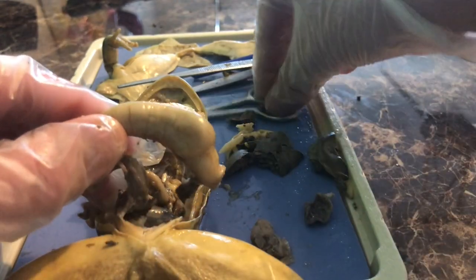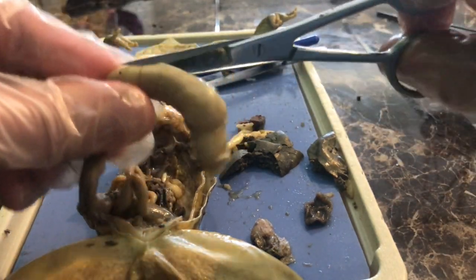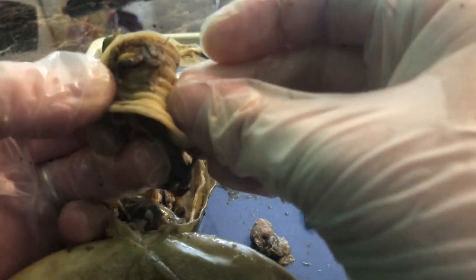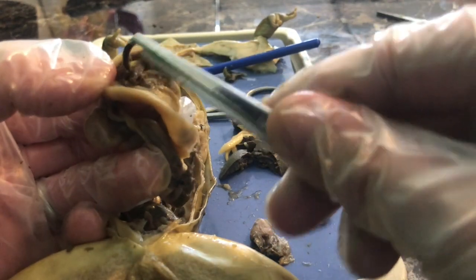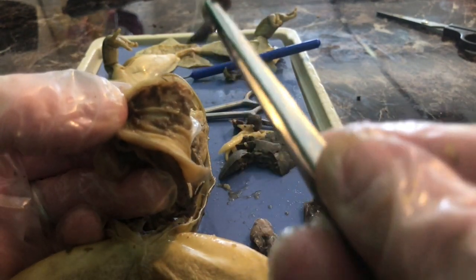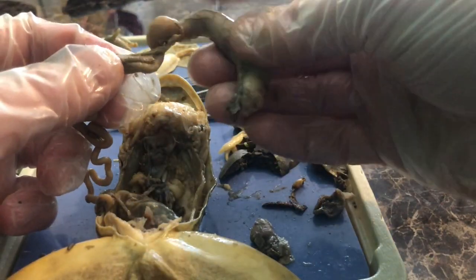Now let's look at the stomach specifically — it specifically curves and digests proteins. I'm going to cut open the stomach to see the internal structure. You can see these lines — these folds inside the stomach — called rugae. And you can actually see what the frog was eating. It looks like an insect — specifically, it looks like an earwig, and you can see the little pincher structures at the end.